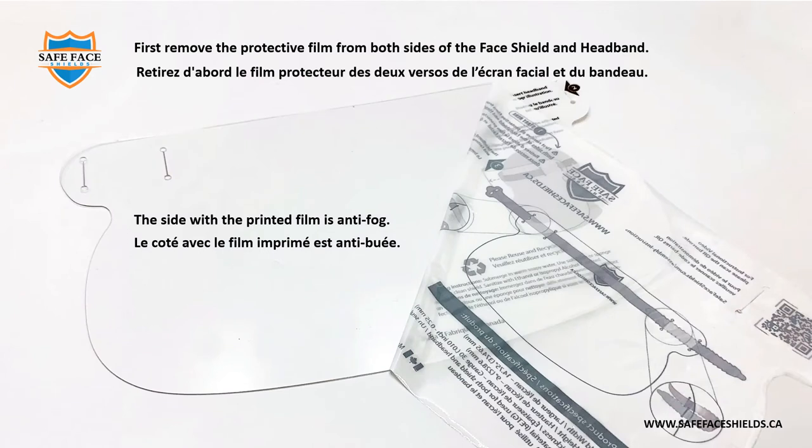This side with the printed film is anti-fog. Le côté avec le film imprimé est anti-bué.